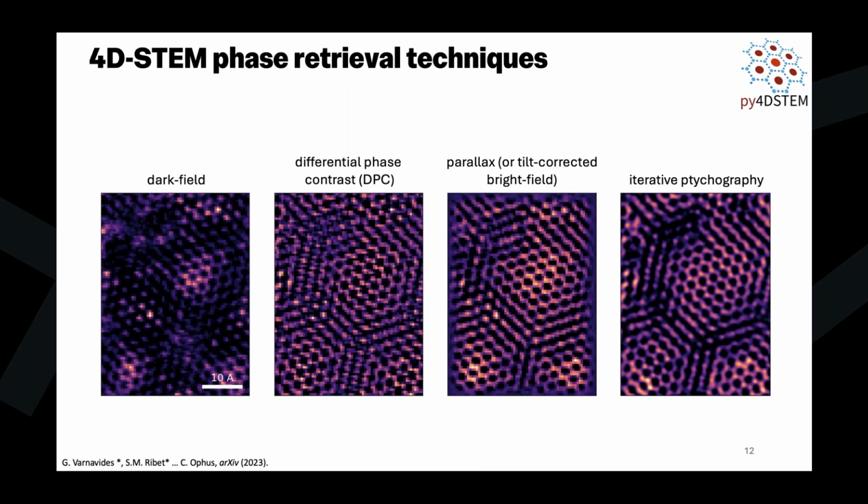And I would also put SSB and direct ptychography in this sort of bucket as well. And then lastly, at the end, we have iterative ptychography. And what's nice is these methods are all different. They have different computational approaches, and they lend themselves to different types of applications. And so it's great that we have different methods.